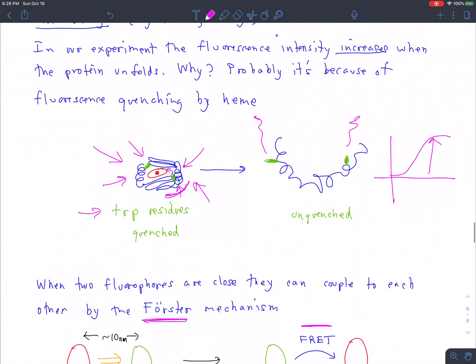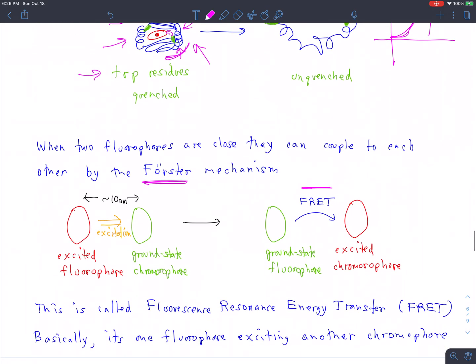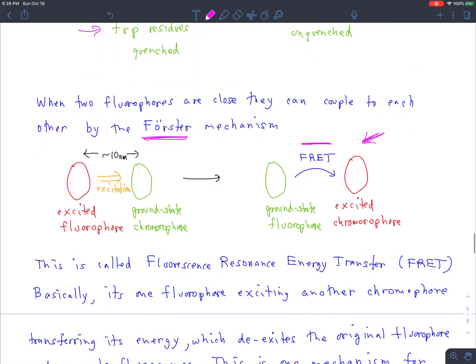The only thing we really need to know is that the fluorescence does indeed increase when the protein unfolds. We don't need to know the details of the physical mechanism, but very likely this is the physical mechanism by which it happens. Basically, you've got a fluorophore here, and its emission band overlaps with the absorption band of a nearby chromophore. In our case, that would be the heme mainly. And so basically, as the fluorophore tries to emit, instead the photon just gets absorbed by the nearby chromophore.